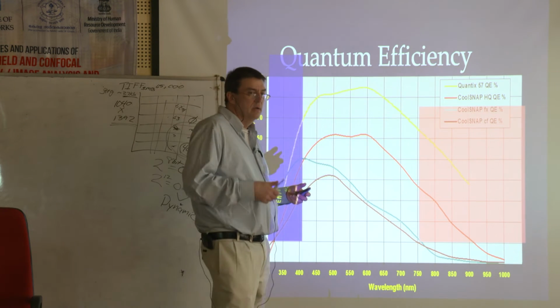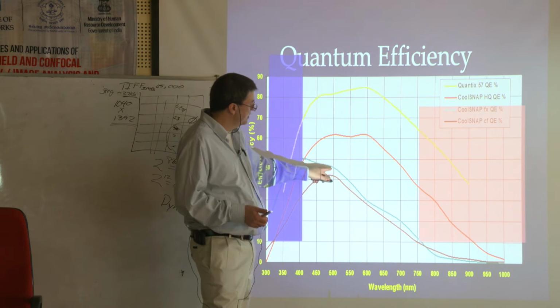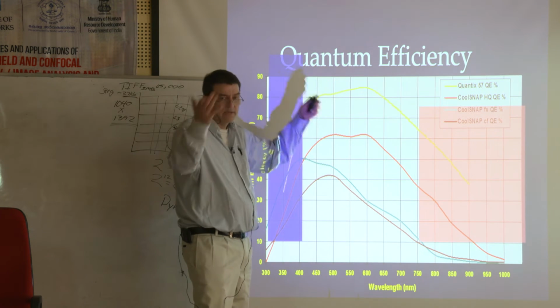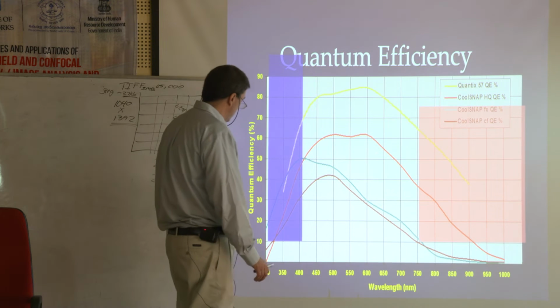Okay, so for normal general lab stuff, you can work down to lower quantum efficiencies. But keep in mind, there are always these extra quantum efficiencies.